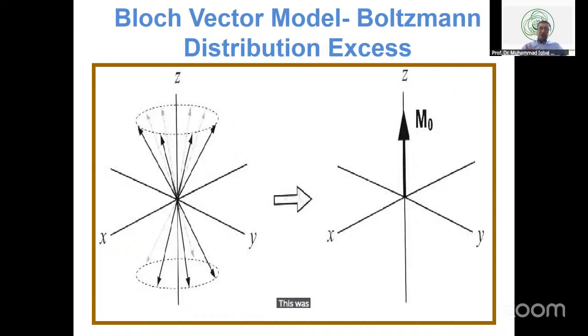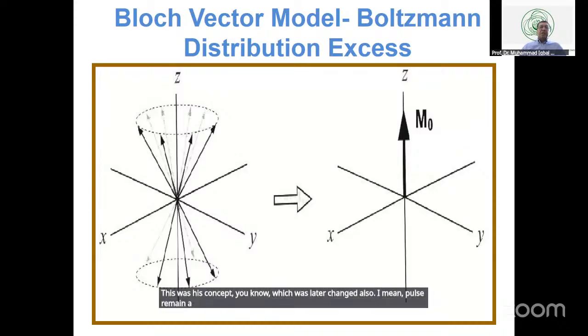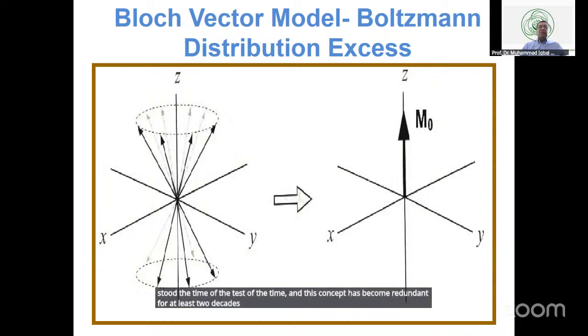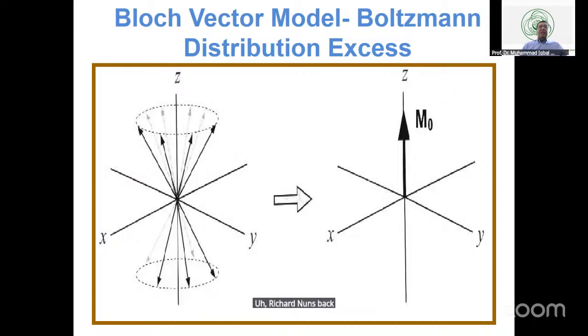This was his concept, which was later changed also. I mean, pulse remained a good concept, but relaxation or excitation in terms of radio frequency didn't really stand the test of time, and this concept became redundant for at least 2 decades. And only when Richard Ernst, back in the late 60s and early 70s, developed this concept.